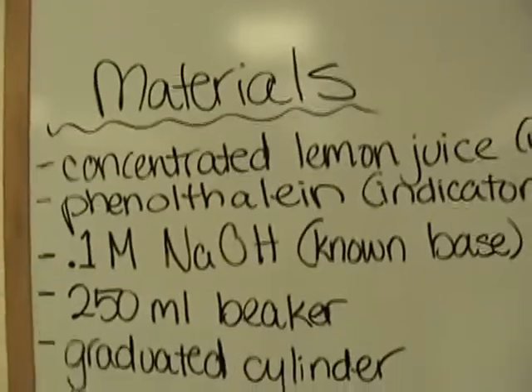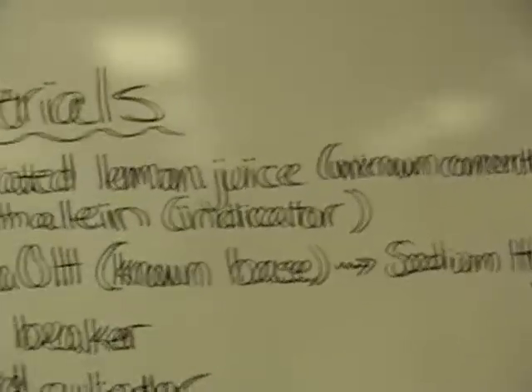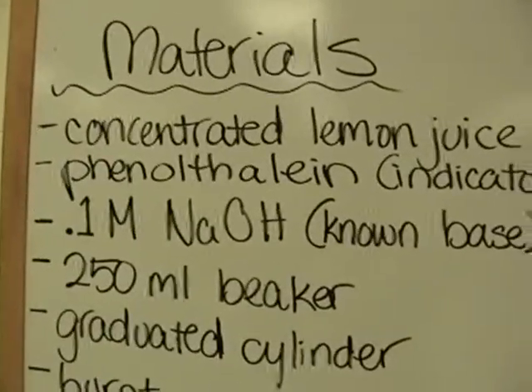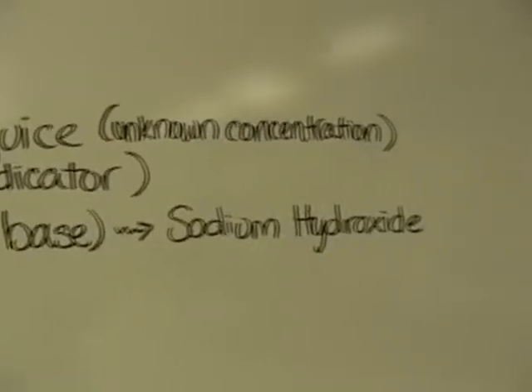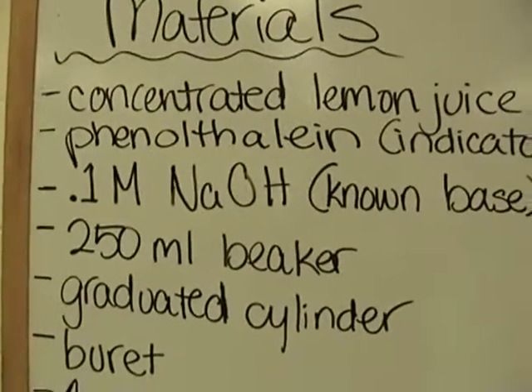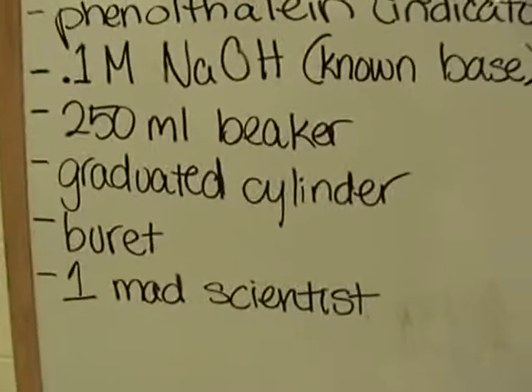Our materials for this experiment are concentrated lemon juice, which is our unknown concentration; phenolphthalein, which is our indicator; one molar of our known base, which is sodium hydroxide; a 250 milliliter beaker; a graduated cylinder; a burette; and one mad scientist.